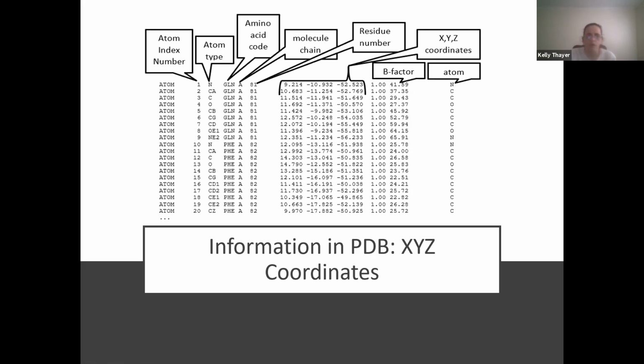That would be important to differentiate. Within a particular residue, no two atoms can have the same atom type. These are going to be unique within a residue, whereas for the atom itself, the column over here being on the periodic table, of course you could have more than one carbon in the same residue. So that's the difference between those.